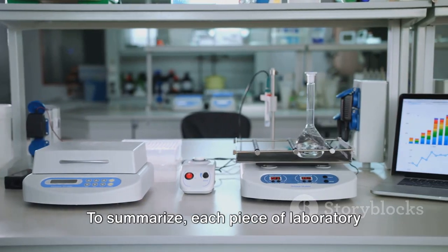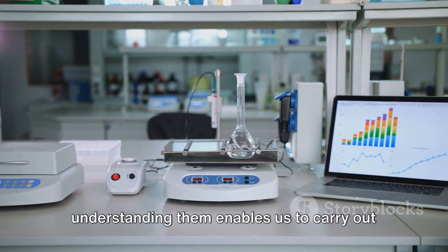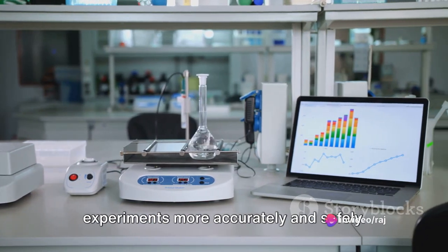To summarize, each piece of laboratory equipment has a unique purpose and understanding them enables us to carry out experiments more accurately and safely.